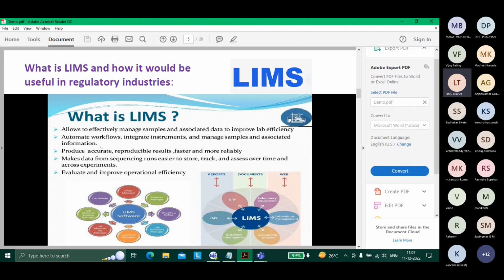One fine example I can give is in LIMS, for result accuracy, we can select up to how many decimal places we need to show the results, and whether we need to round the result values or not.